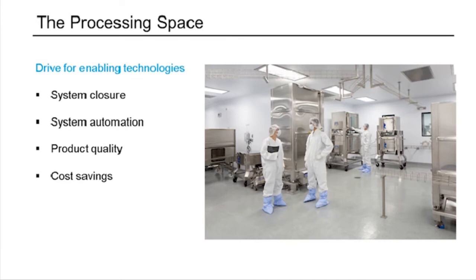And so I touched on earlier that there's not a ton of options available on the market for patient-specific scale, but vendors are noticing this, and we're starting to see this shift in the marketplace. So things like the Miltenyi CliniMACS Prodigy system, or the Octane Cocoon that was getting a lot of press, I think late last year. We're starting to see closed automated systems that can help support this patient-specific scale.